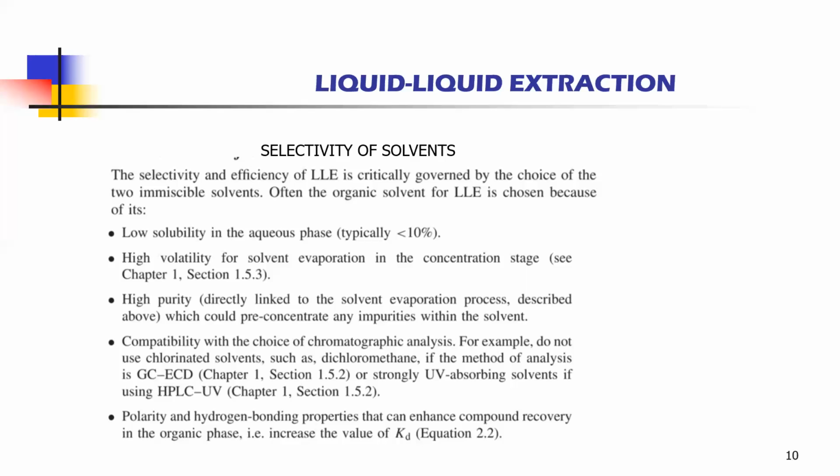And the last point is polarity and hydrogen bonding properties that can enhance compound recovery in the organic phase, that is, increase the value of Kd that we have already seen in the previous discussion.